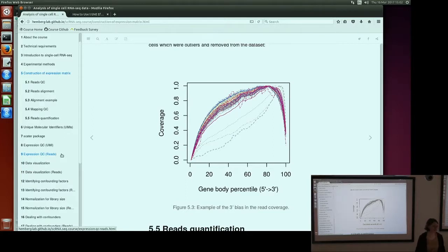The bulk RNA-seq packages will normalize them for you. Single-cell DE packages don't necessarily normalize them for you. Strictly speaking, like DESeq2 and edgeR use the raw counts, but make adjustments in the model by way of offsets to account for differences in library size.